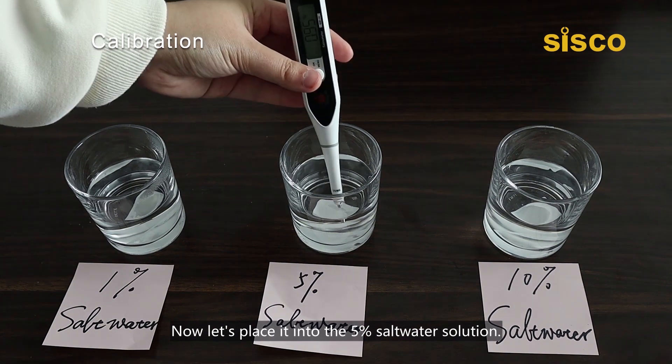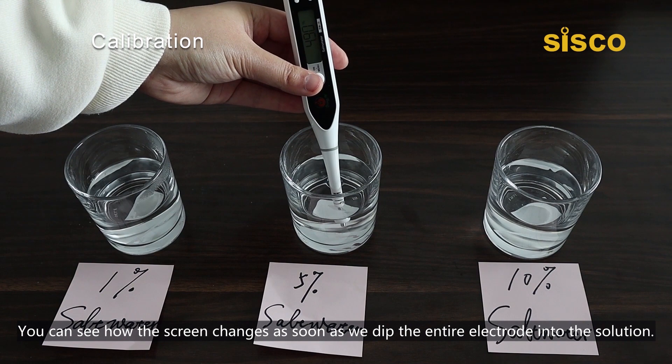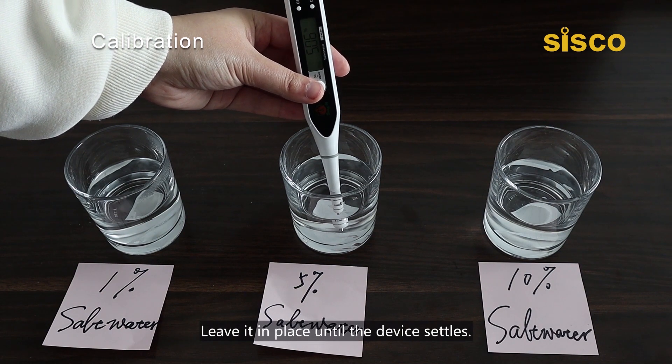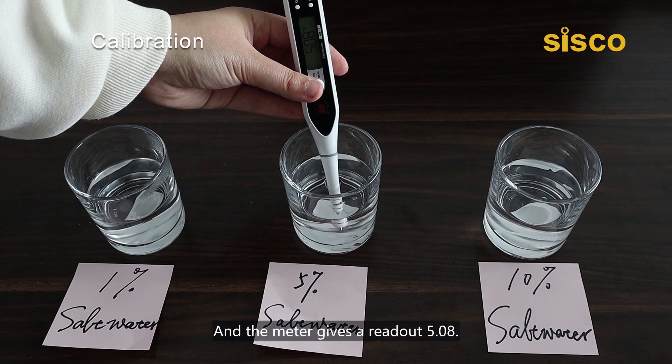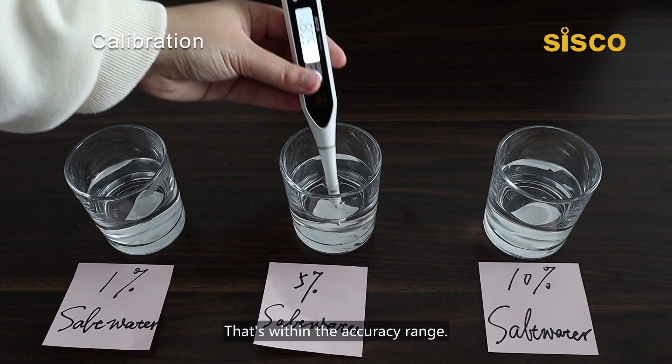Now let's place it into the 5% salt water solution. You can see how the screen changes as soon as we dip the entire electrode into the solution. Leave it in place until the device settles. The meter gives a readout, 5.08, that's within the accuracy range.